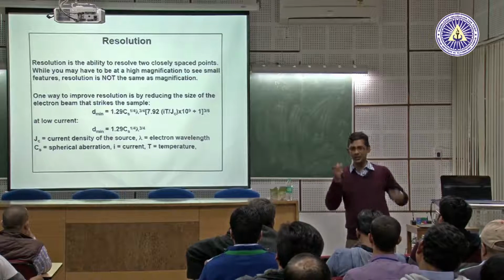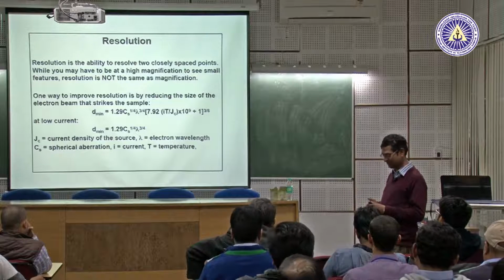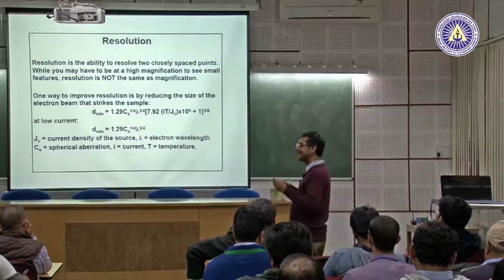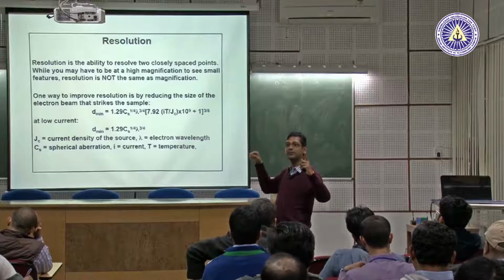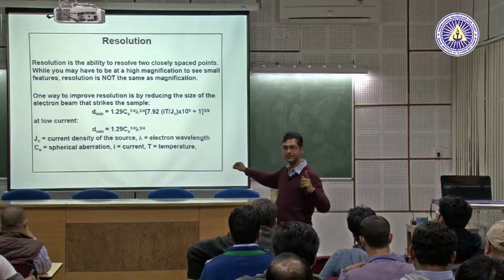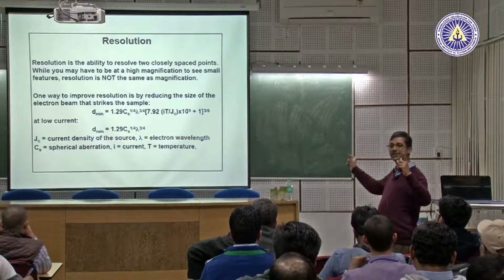Any lens, whether my lens or your lens or whatever, electron lens undergoes aberrations. And there are two types of aberrations. What is the first one? Spherical aberrations. What is spherical aberration? You have a single wavelength. If it goes through the center of the lens and if it goes to the periphery of the lens, you cannot focus both of the beams in the same position on the image plane. You know that, right? That's not possible. So a point will be seen as an extended object.